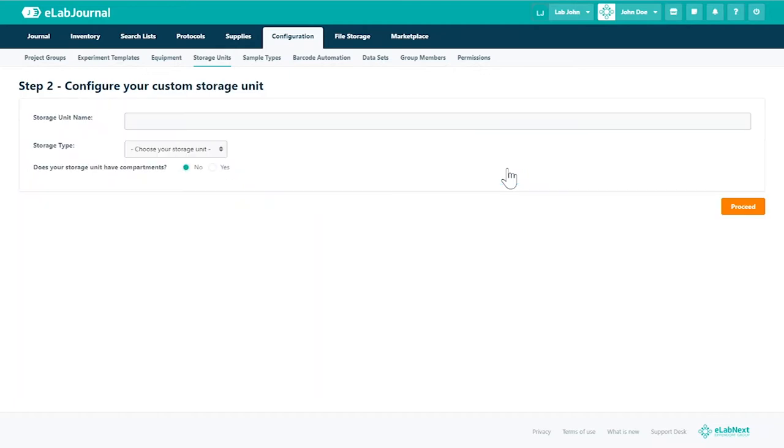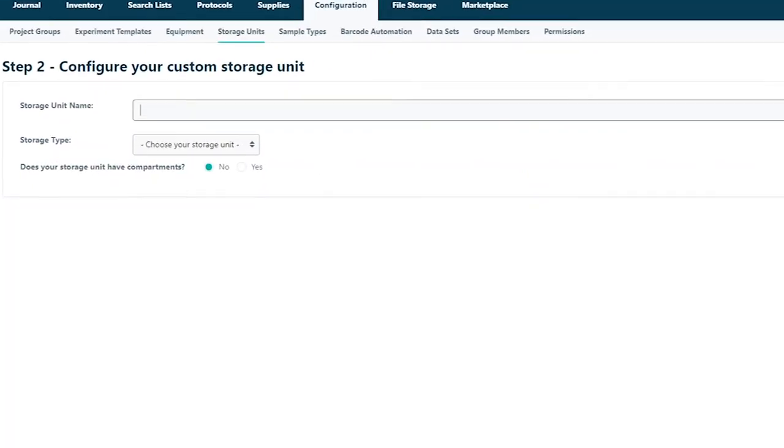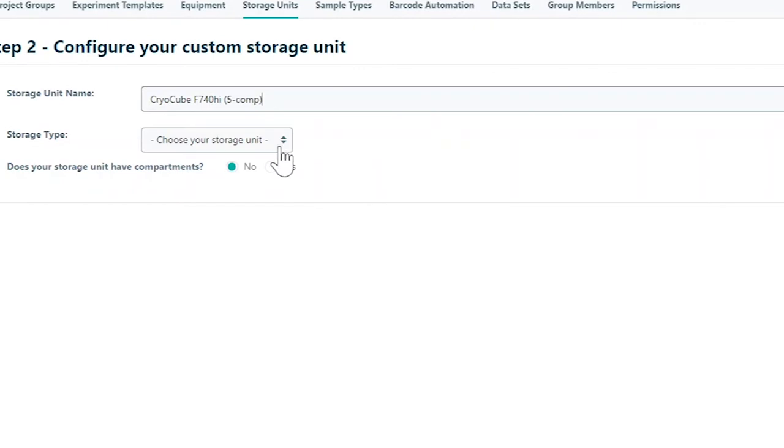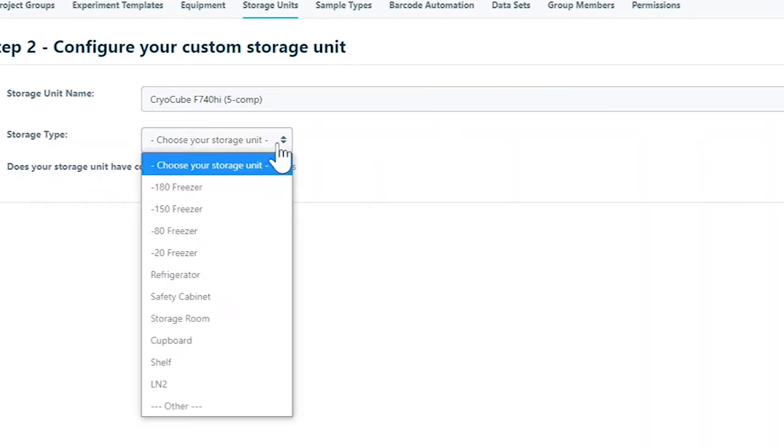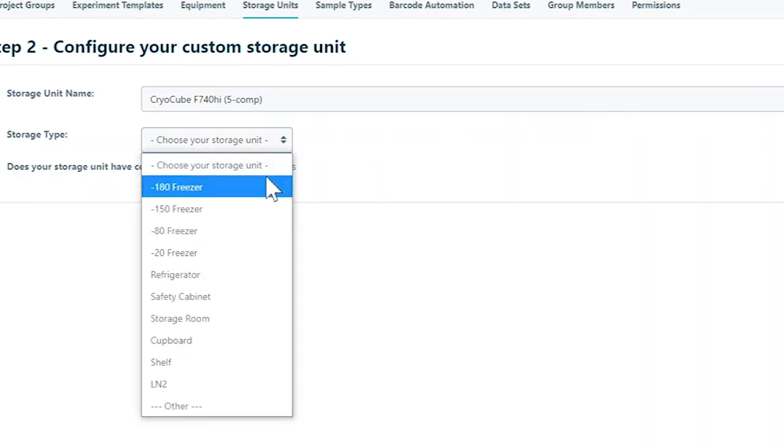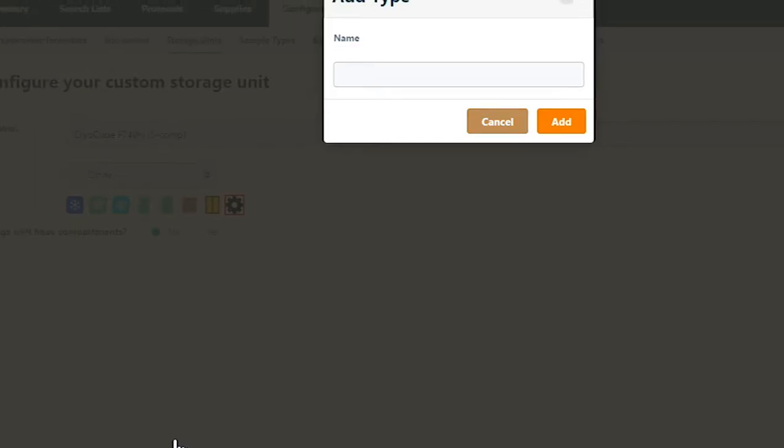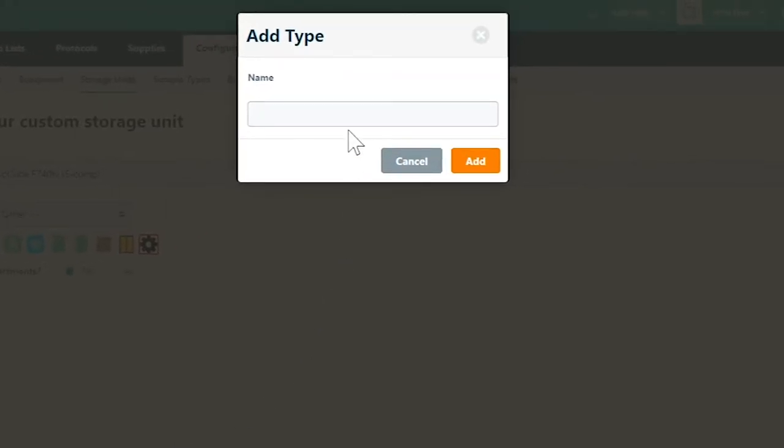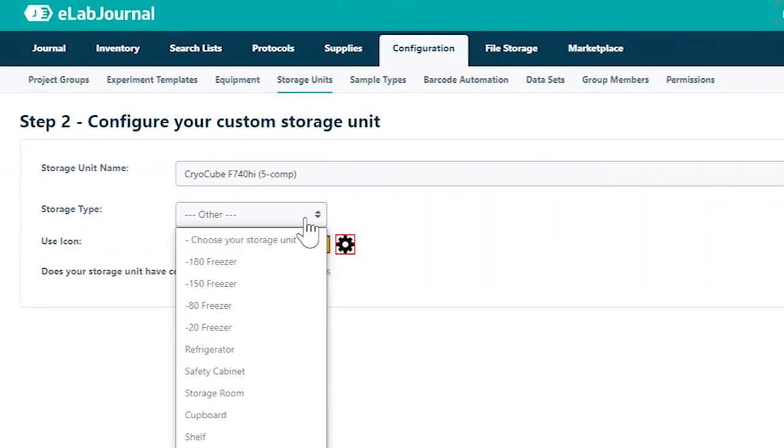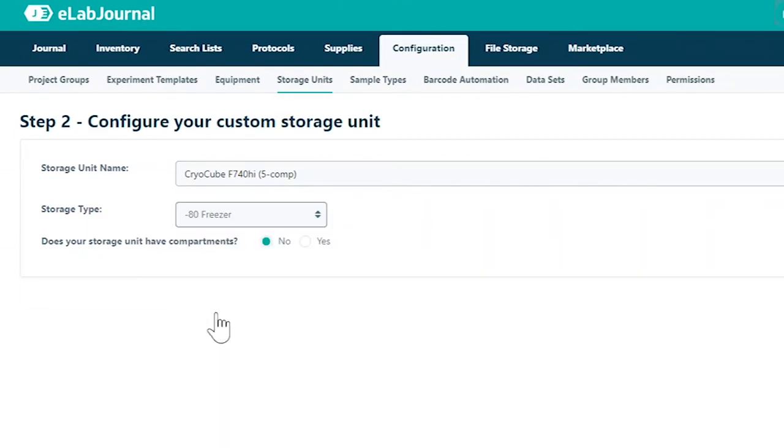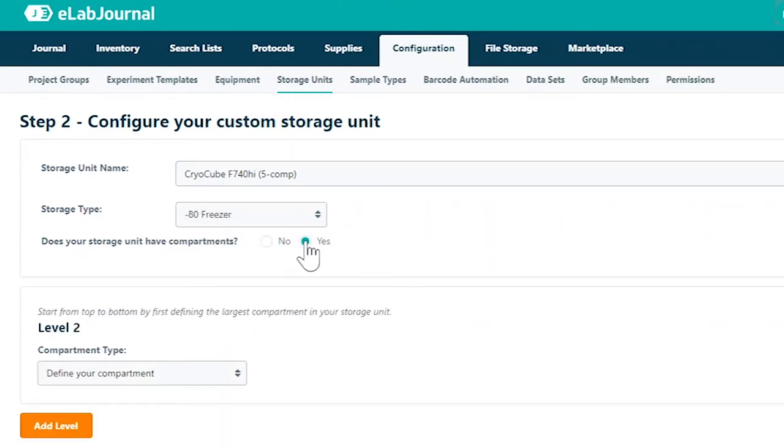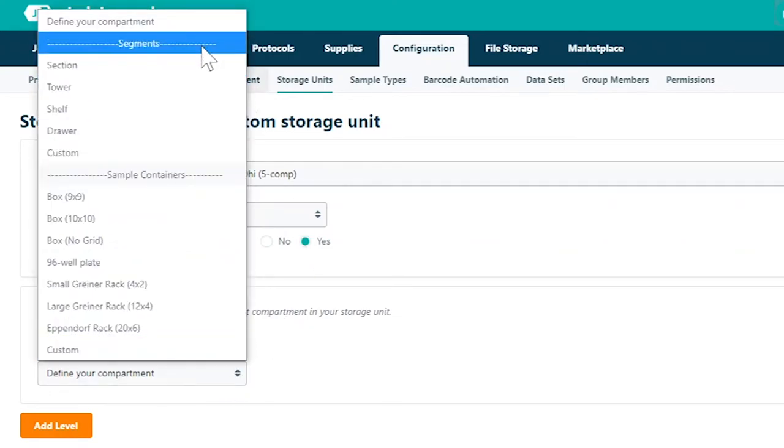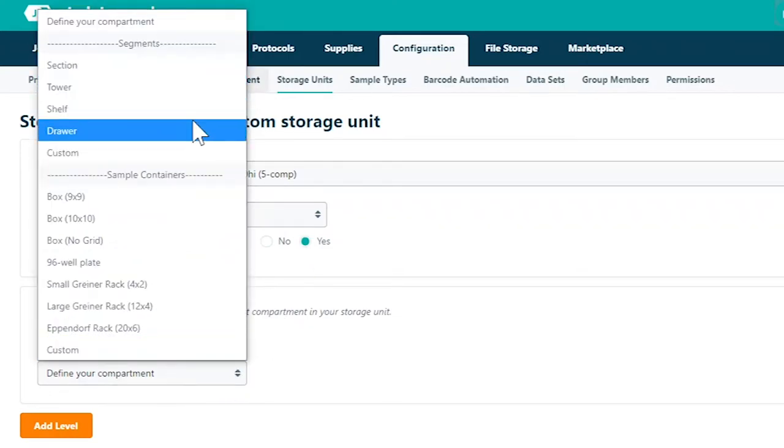When configuring a custom storage you may select one of the default location types or create a custom location type. Once you have entered the name and selected a storage type, define the different compartments within the storage unit.